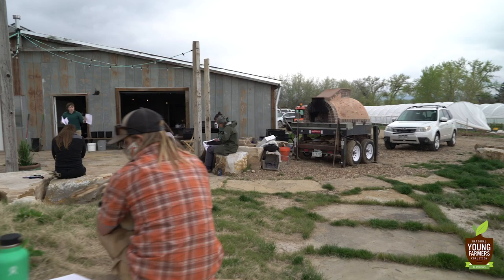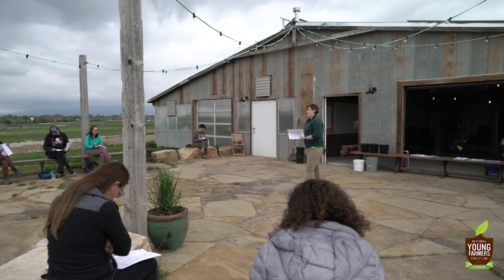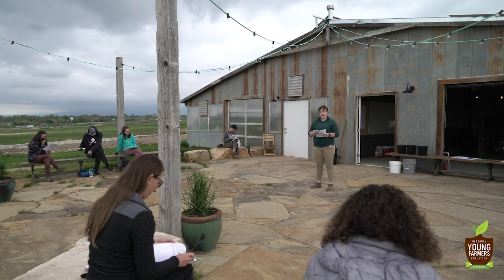And then finally, our last one from CSU is going to be a compost test. I included it in here, largely because I will sometimes forget, like a quick primer on how to read your major nutrients from a compost test. You don't have to read it right now, it's just there if you have thoughts about it later, because the next page is our please flip.